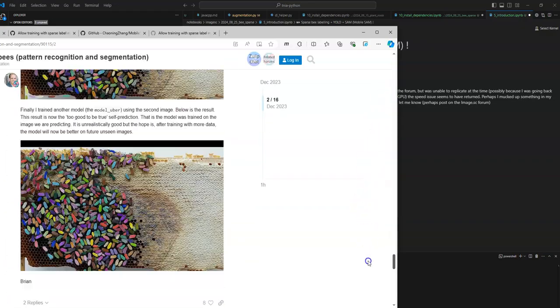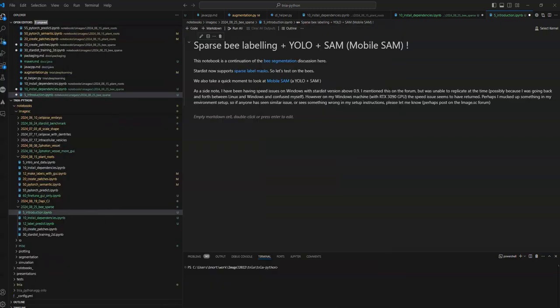One of the things I did was try Stardist on it, and I already did a couple of videos on this. New video is going to go over a couple of new things. One, Stardist now supports Sparse label masks, and that's a really powerful feature. So I'm going to go over what that is and why it's so great. And then I'm also going to take a quick look at MobileSam, which is a YOLO+SAM variation.